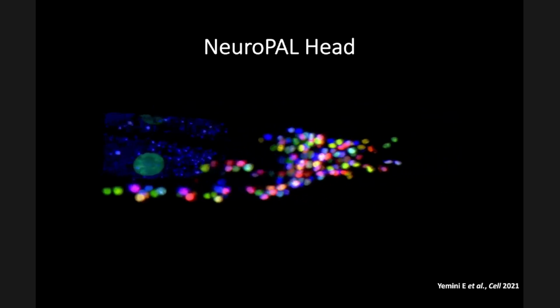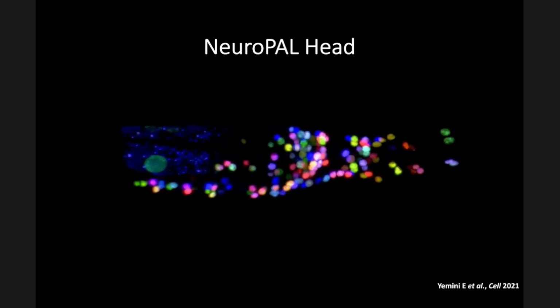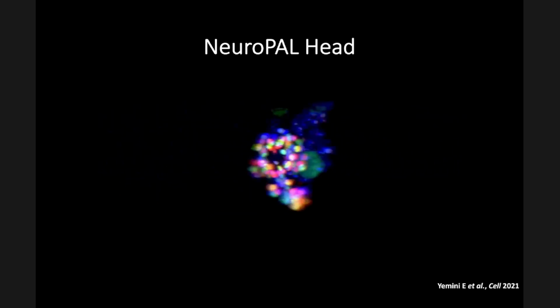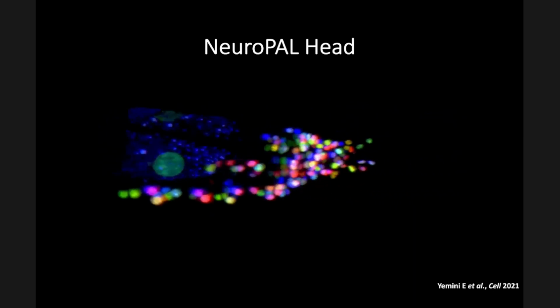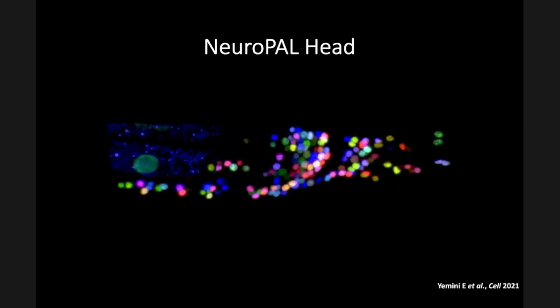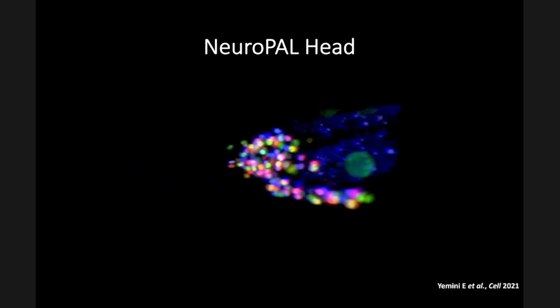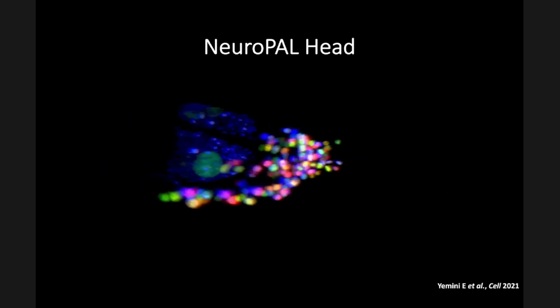So we never really used that 4th channel, except for just saying this is a neuron because it's got the 4th channel in it, and this isn't a neuron because it doesn't have it in it, right? And so we could have used it. From that perspective, we could use more information in a variety of places. We can use shape. And in fact, some nuclei are big and some are smaller, and that helps sometimes ID. Some are oblong and some are more circular. There's a lot of stuff that we could kind of use.